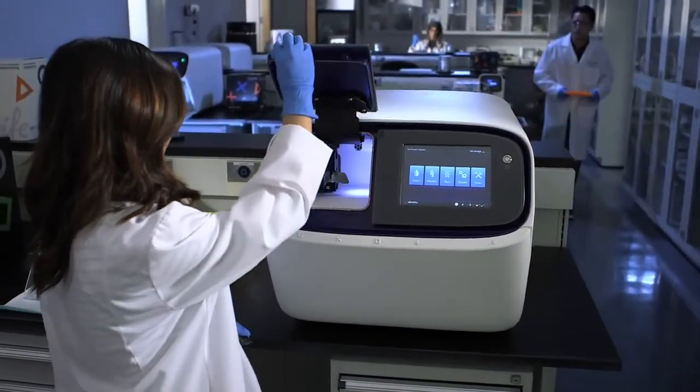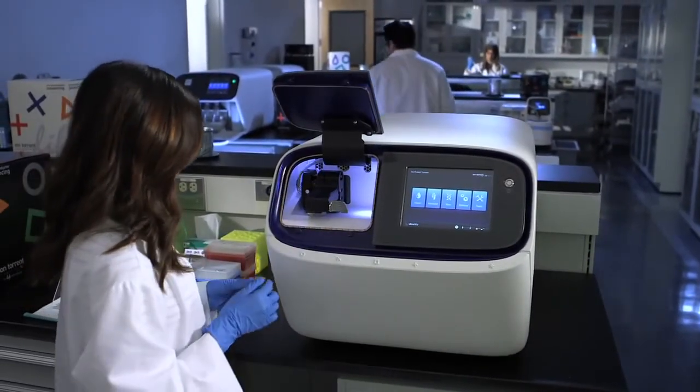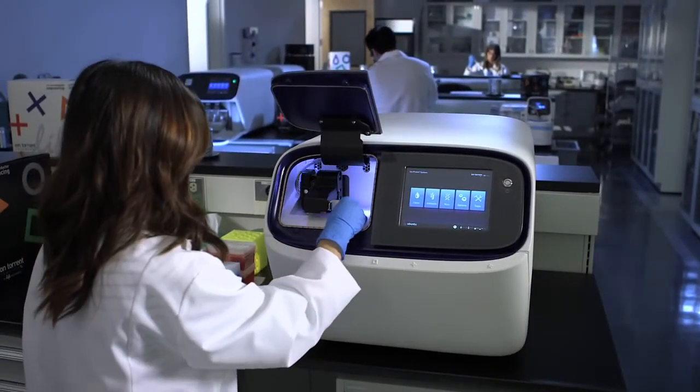Ion AmpliSeq Exome gives you a simple and fast workflow. Ion Proton gives you simple and fast sequencing. And Ion Reporter and Torrent Suite software give you push-button data analysis. This solution is truly enabling for everyone to do exome sequencing.